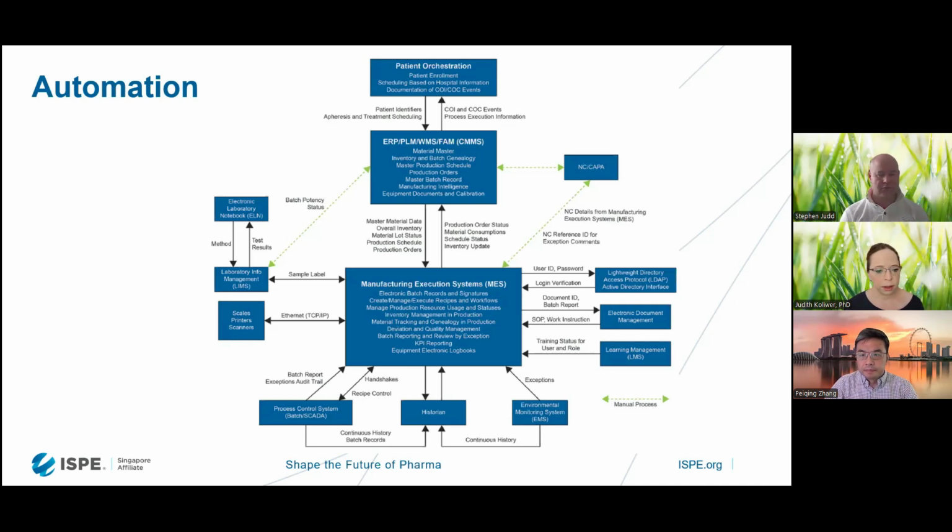What we have seen as most successful is if the MES knows the calculations, it knows how many expansion days we need, it can be the leading system when it comes to orchestration of the sampling. That doesn't mean that the LIMS can't create, for example, the sample IDs and also the sample labels.